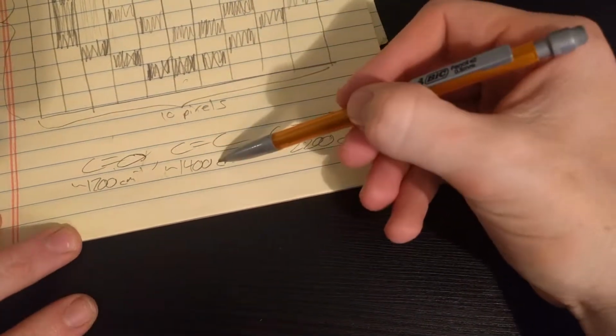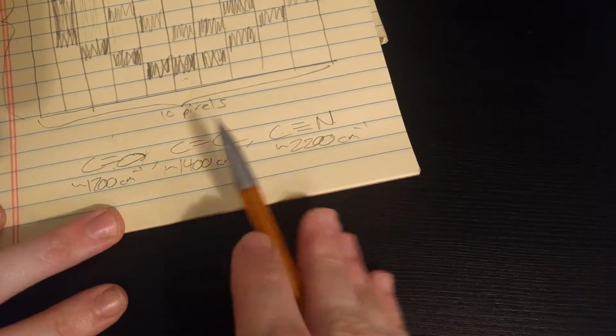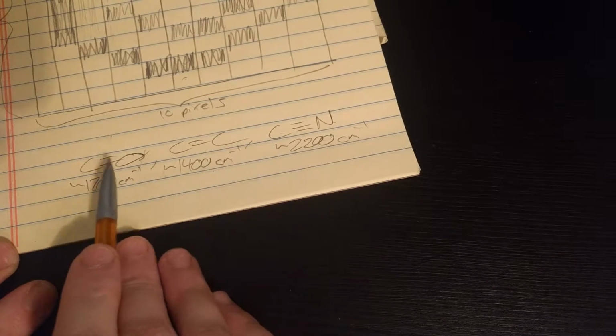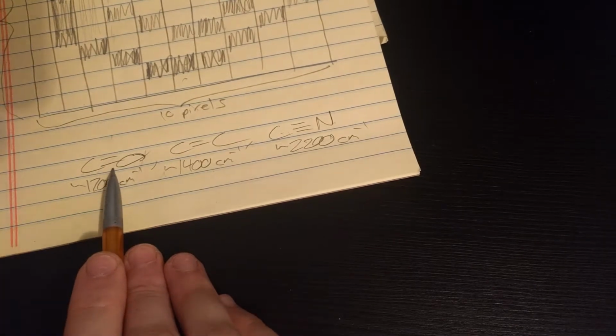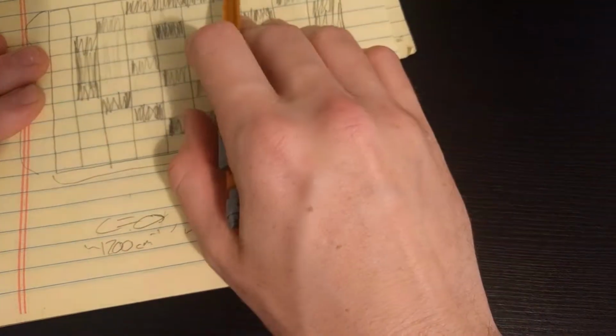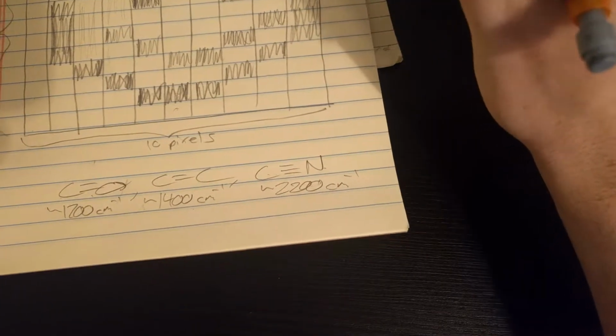But it doesn't matter where they show up. The point is that the peaks are distinct. So essentially, if we have 3 different molecules, and each of these molecules have their own unique vibrational mode, by taking the same 100 spectra, we can make 3 images.